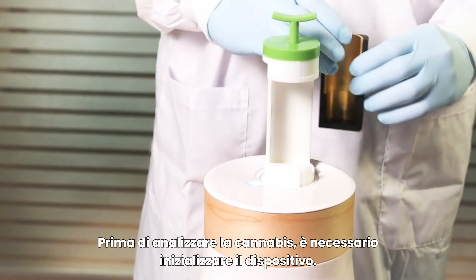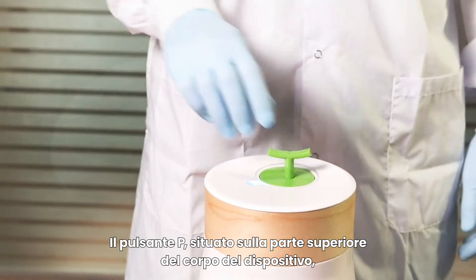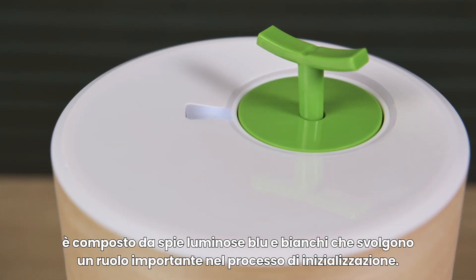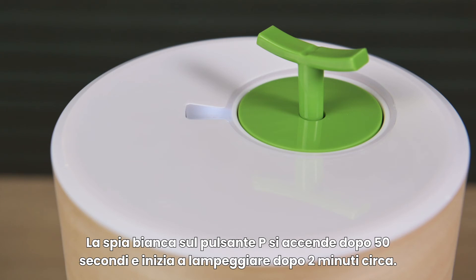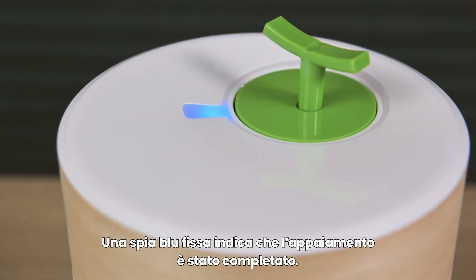Before analyzing cannabis, you must initialize the device. The P button, located on top of the device's body, contains blue and white indicator lights, which play an important role in the initialization process. The white indicator light on the P button is lit in 50 seconds and starts blinking in about two minutes. Blinking white indicates the device is ready for pairing. Blue steady indicates pairing complete.